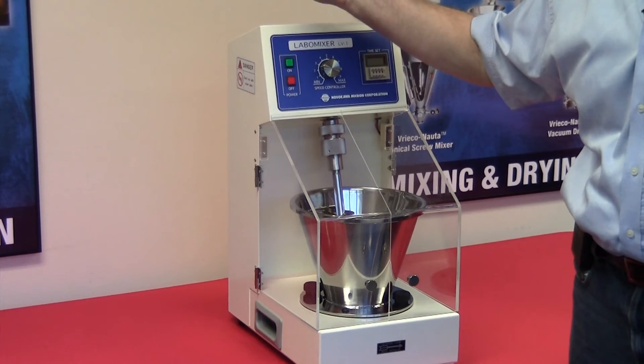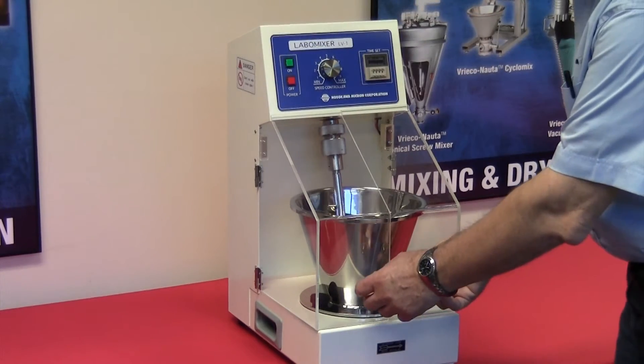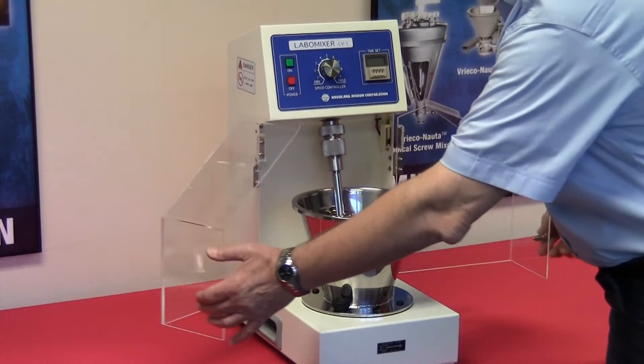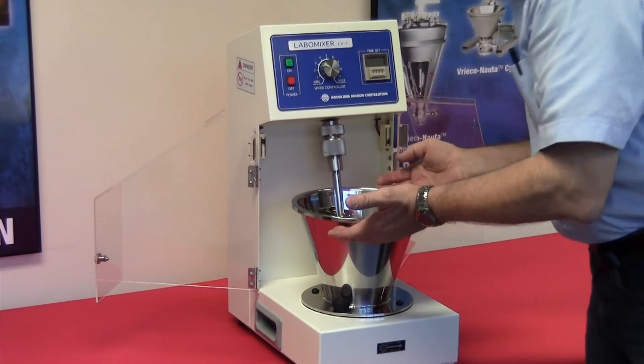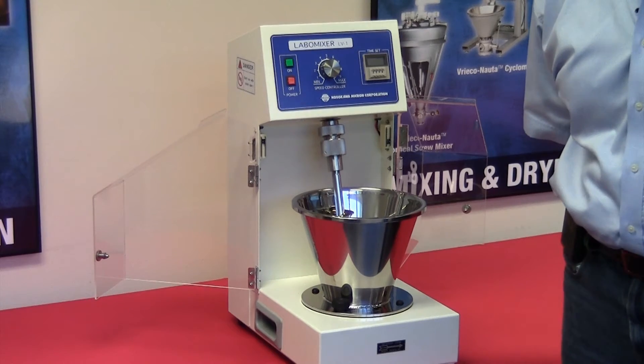Off shuts the unit down. Now, while the unit is operating, there is a safety measure that will actually disengage the power and stop both the bowl and the mixing screw during operation should the doors be open.